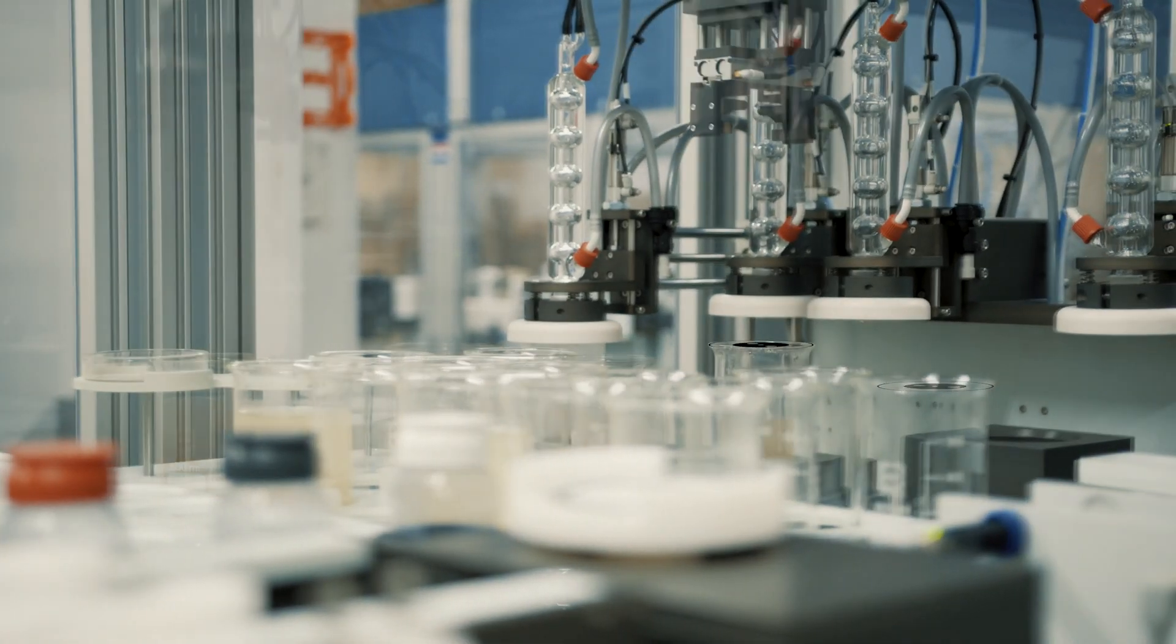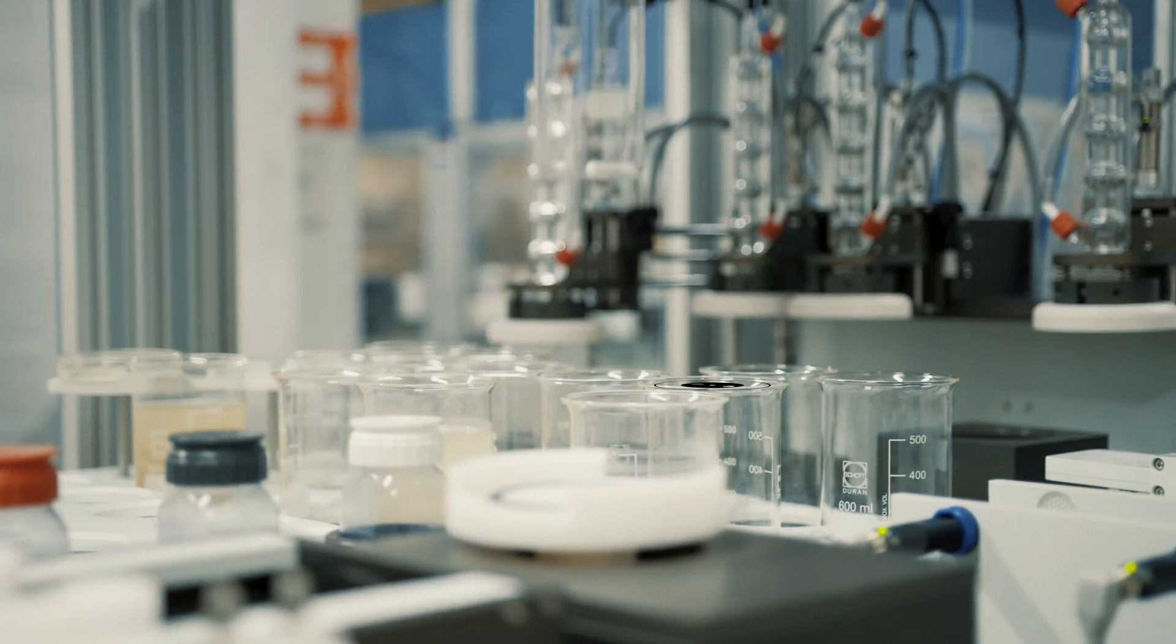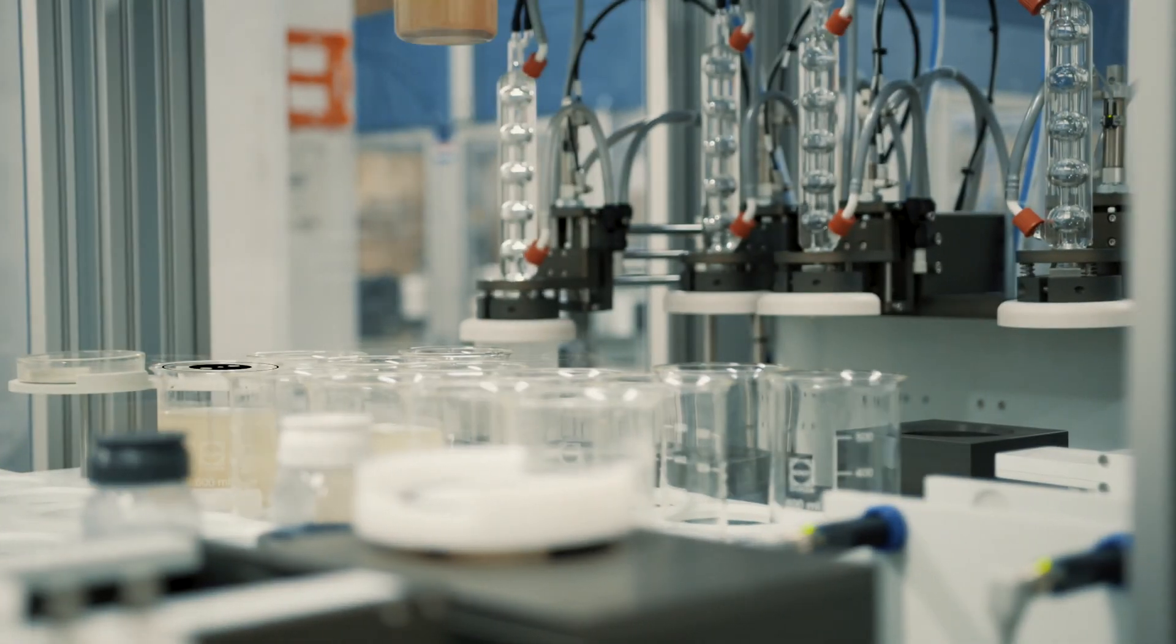The new eye-catcher in your laboratory. The jewel in high-tech reliability.